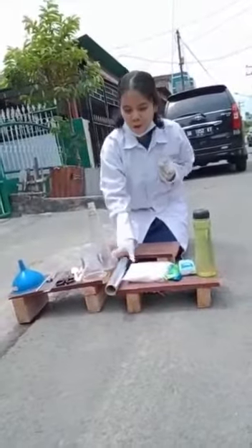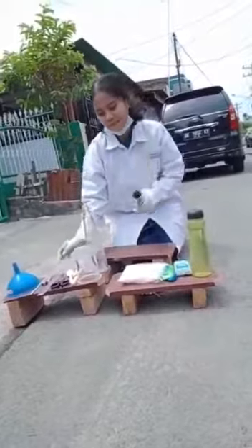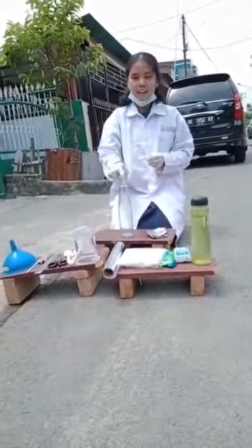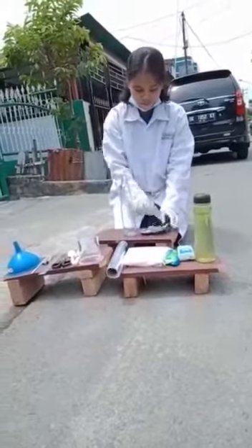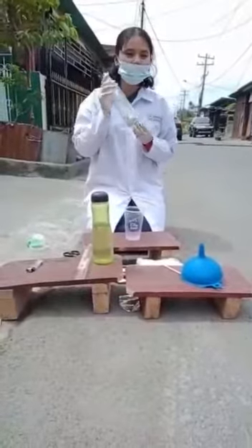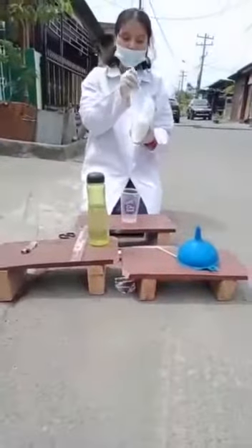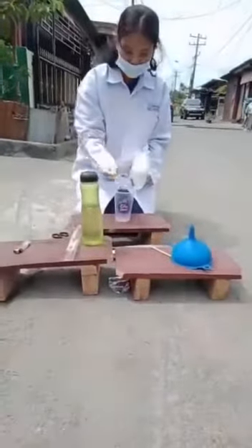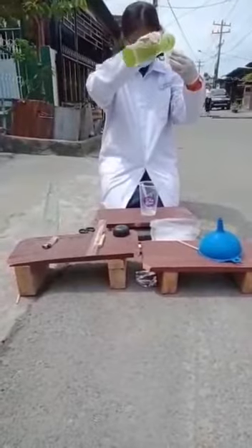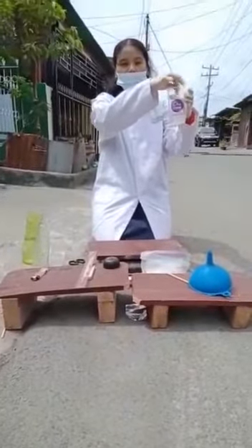Let us do the experiment. First of all, we divide the aluminium foil into small pieces with a size of 9 by 7 cm, like this. And then we place this aluminium foil into the glass beaker. After all the aluminium foil has entered the glass beaker, we make the sodium hydroxide solution. We add half of three spoons of the sodium hydroxide, and then we add water to this cup. We mix it until the sodium hydroxide and the water form a homogeneous solution.